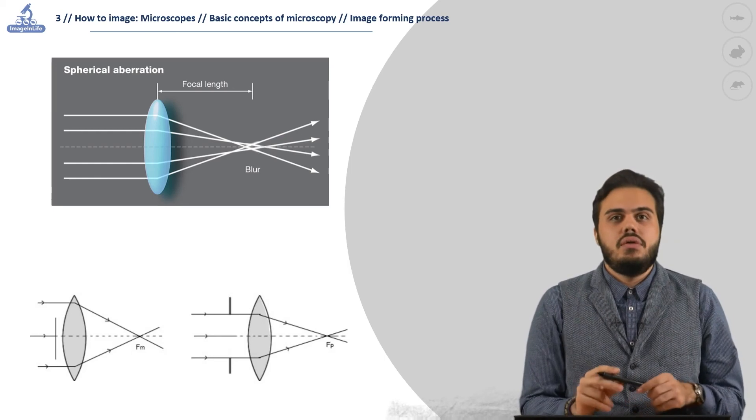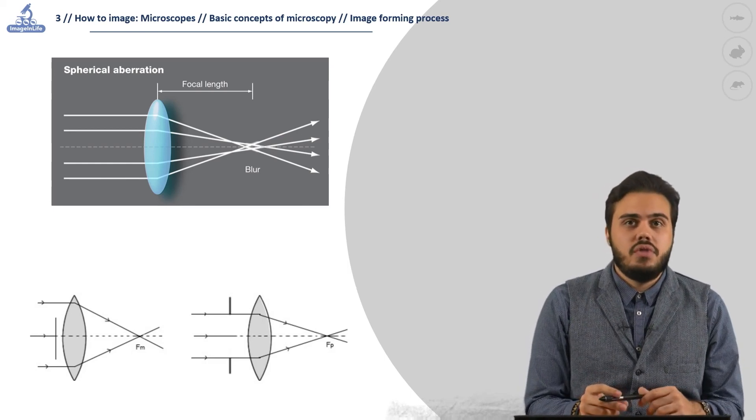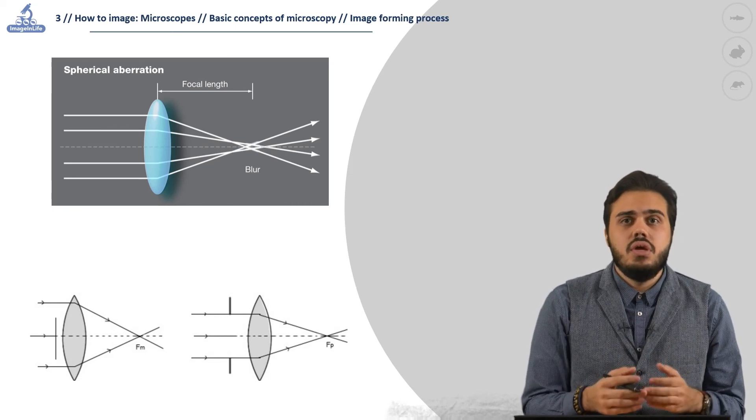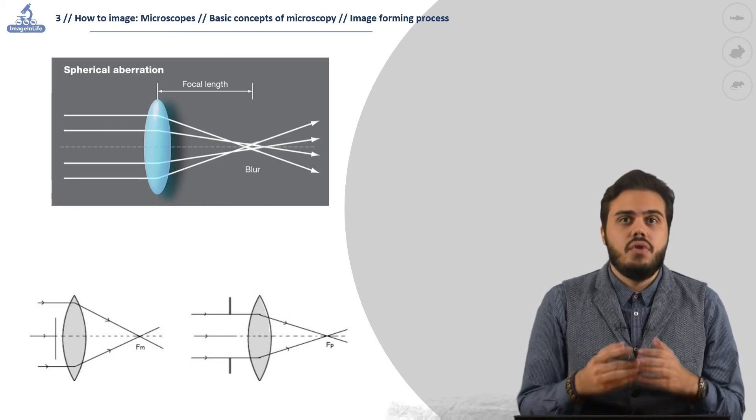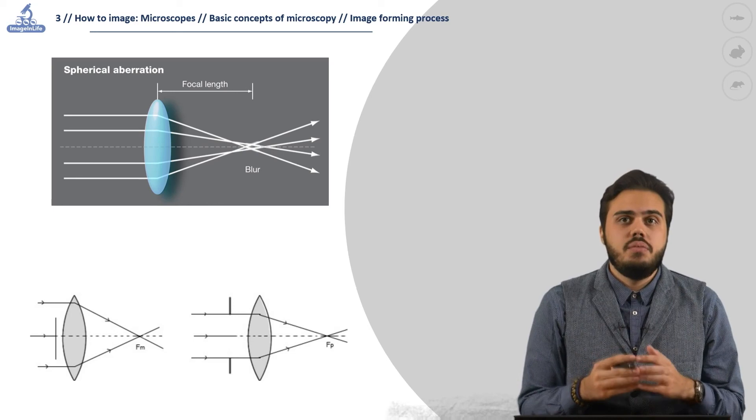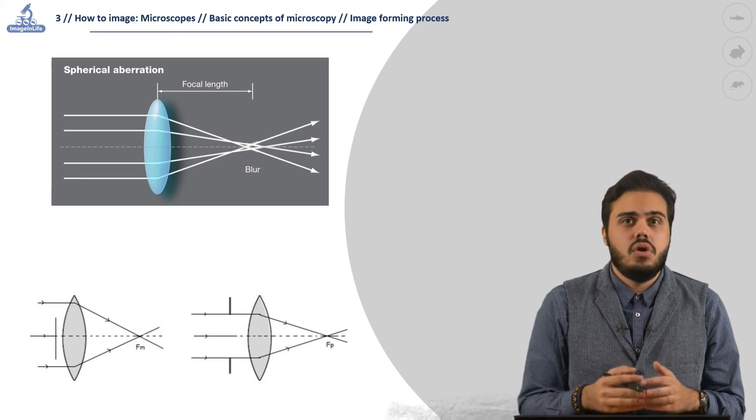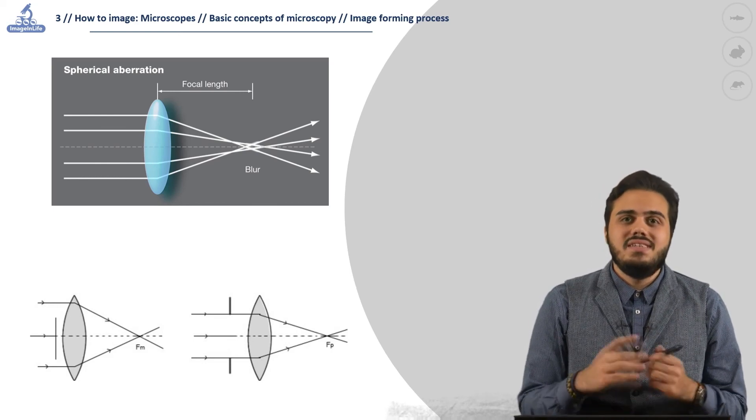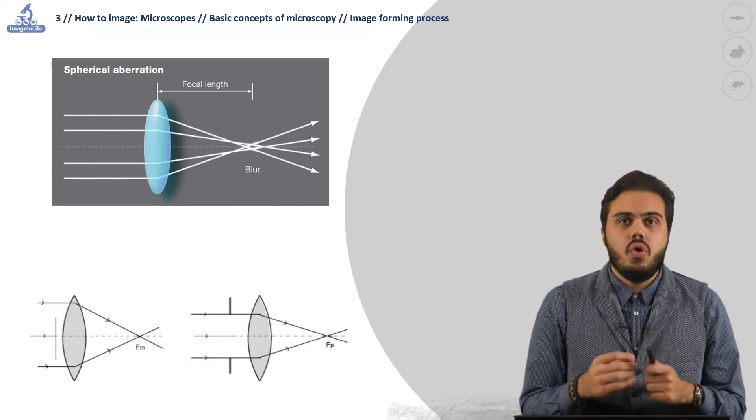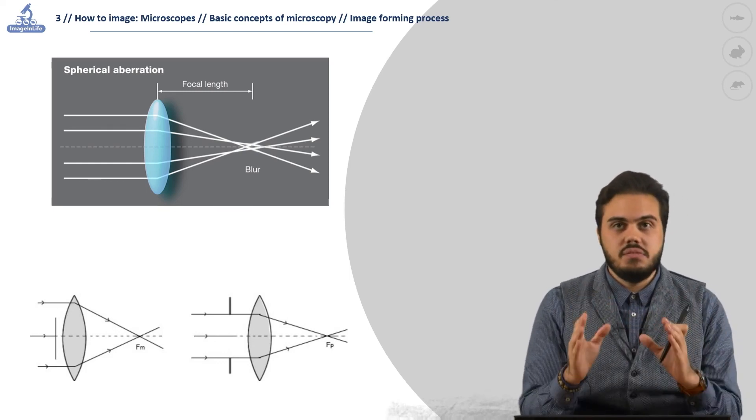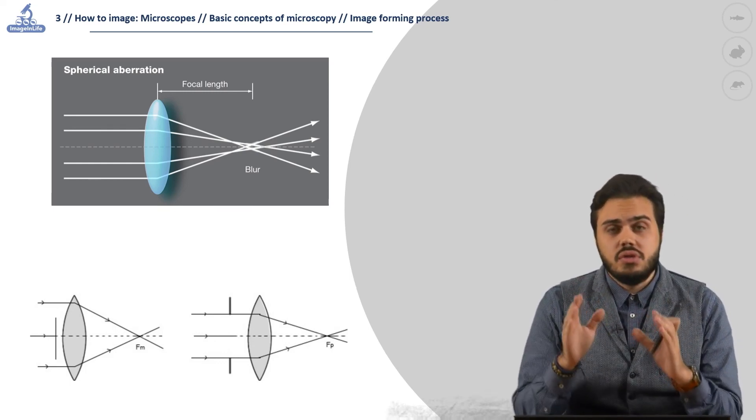Another simple method is to lower the aperture of the diaphragm, cutting out the peripheral light that usually presents the highest level of aberration. But as we said before, at the end a lower aperture decreases the resolution of the microscope. This is why in microscopy we always have to compromise, considering which aspect of the specimen and acquisition take priority.